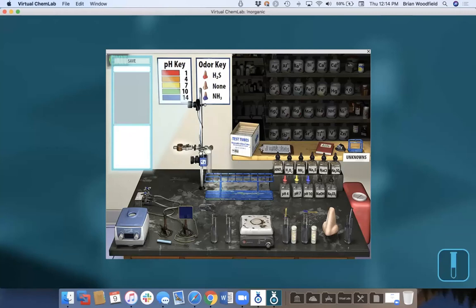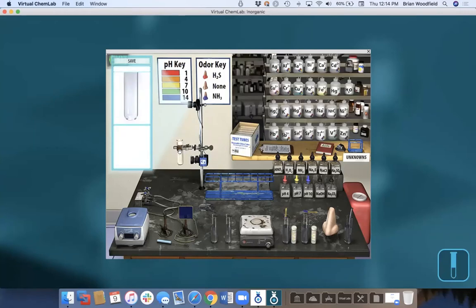What you can do is pick a test tube. It's an empty test tube, and we're going to show you a real picture of what's here. Now I can add any of these cations, in any order, any combination. If I add copper, for example, I'm going to show you a real picture. And down in here, I'm going to show you the current state of that cation in the test tube. I can add cobalt and you'll see a real picture. Then I'm going to add chromium and you'll see a real picture of what that mixture will look like.